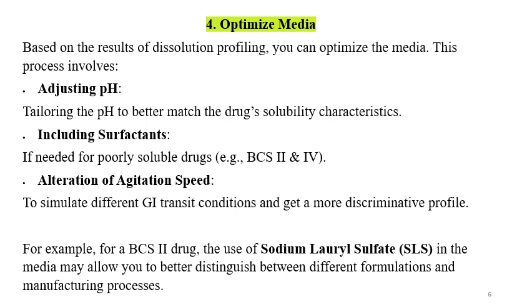Method is required to be optimized. So first is optimize the media. Based on the results of dissolution profiling, you can optimize the media. This process involves adjusting pH, including surfactants, alteration of the agitation speed, change in the dissolution media volume. So these are some of the points to consider for optimizing the media.